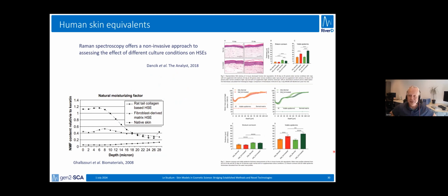quiet conclusion is that the skin models in terms of their molecular anatomy still leave something to wish for when compared to the actual in vivo skin situation. There's very little in terms of skin barrier formation. I mean, actually functional skin barrier formation.